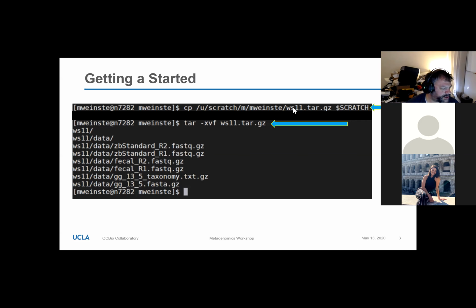And then for Yajing, okay, so you weren't actually even able to cd into, oh, okay. According to Yajing, you found your problem. So yeah, after this, you'll be replacing my scratch folder with yours. That means that after this slide, you'll be replacing this first letter with the first letter of your username, and then this with your username.